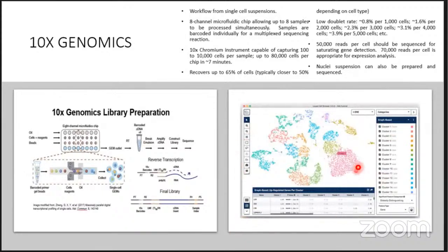This is just a representation of these different kinds of cells. These different types of cells are from a single sample. So don't think that this is a different sample, with different color meaning different sample. No, this is a cluster of cells from one sample only. And you will have millions of such cells from different types of samples.